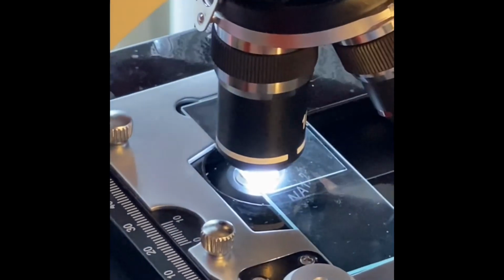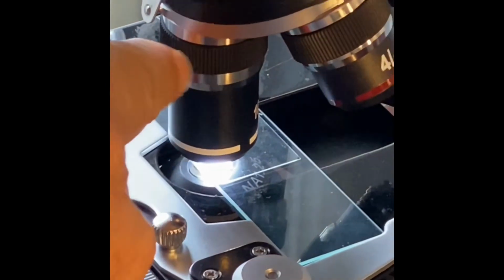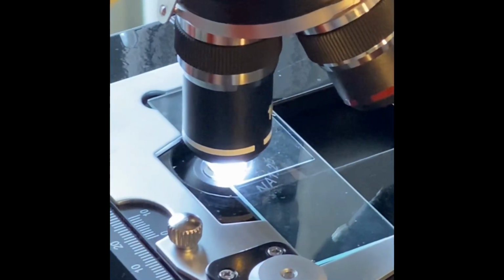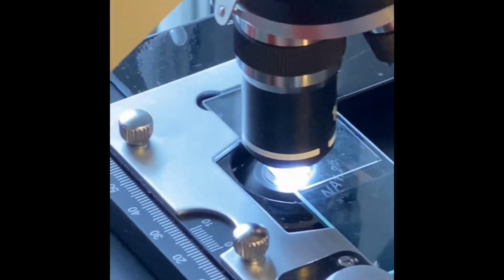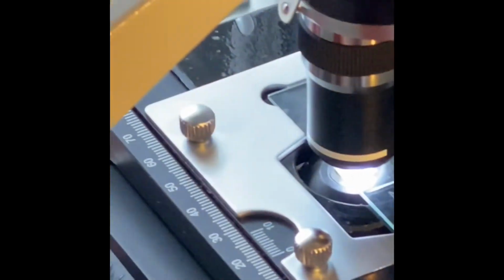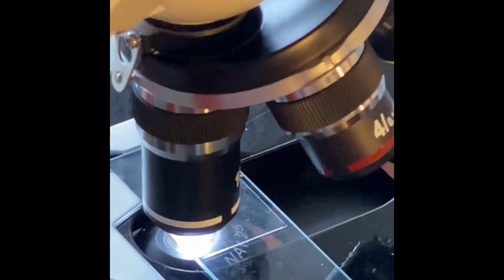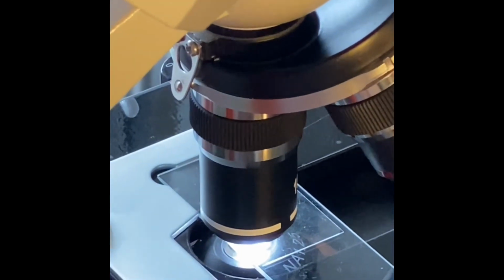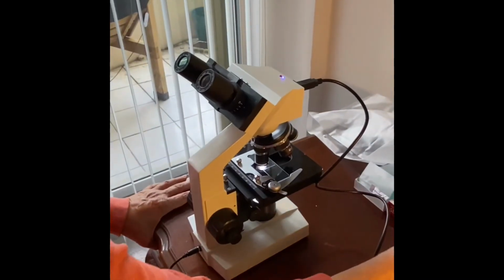And then the last one, you don't use with any liquid or dye. It's for stains that are permanently stained, and you use a drop of oil. It helps see three-dimensional images in more detail. The oil helps refract the light.